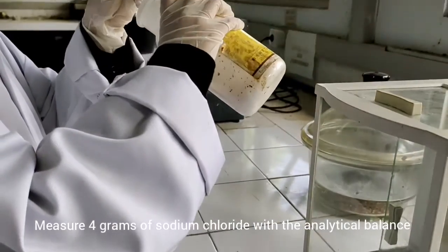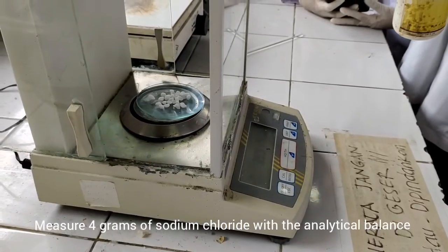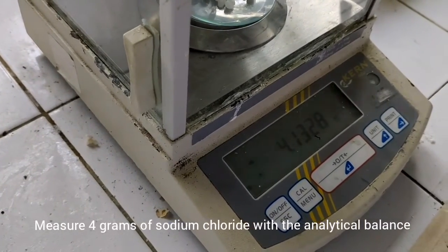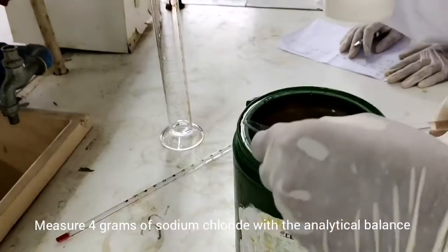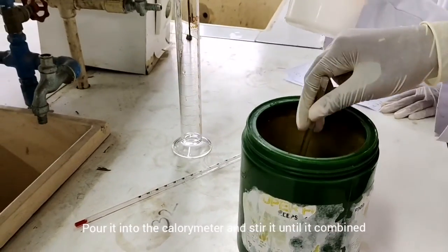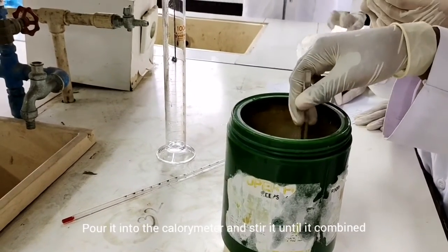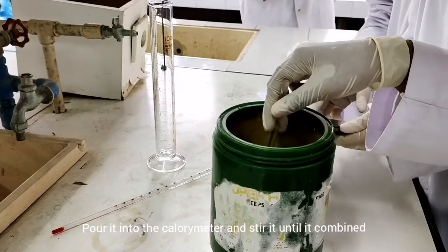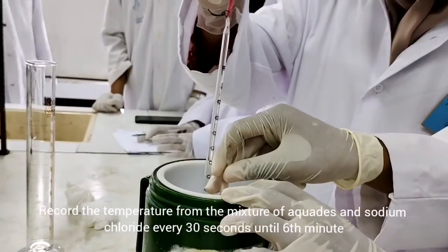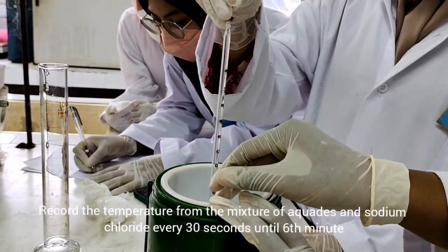Next, measure 4 grams of sodium chloride with the analytical balance. And then pour it into the calorimeter and stir it until it combines. Next, record the temperature of the mixture of aqueous and sodium chloride every 30 seconds until 6 minutes.